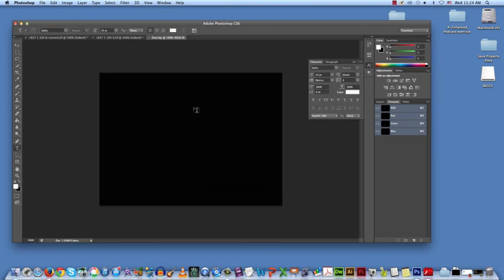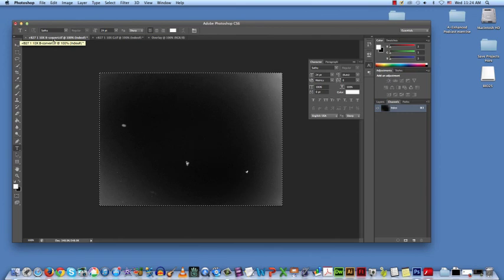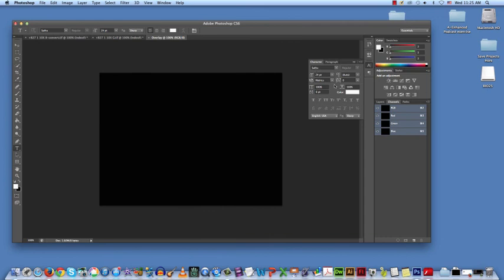Because we've already copied the DAPI image, we already created a copy and placed it onto the clipboard. I know that this DAPI image should be blue. The nuclei were labeled with blue. So when I go to the overlay, you have some options where you can set up different layers, but actually we're going to copy our files into different color channels.